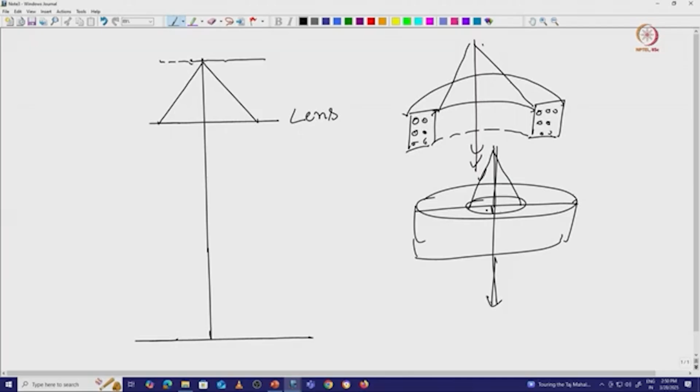This is an on-axis aberration. So most of the time, if the center rays go through, they will not face that kind of problem, but whatever rays go towards the edge will deviate in a different way if the magnetic lens is not perfect.